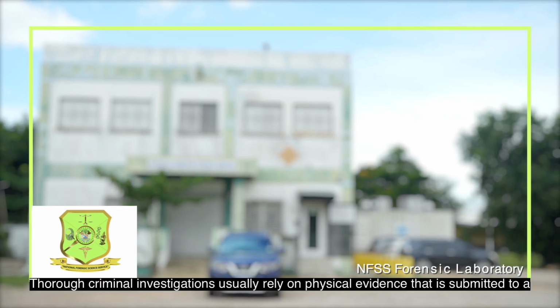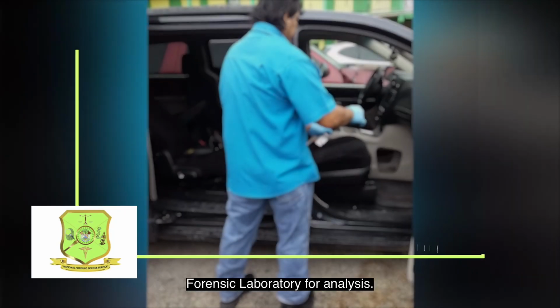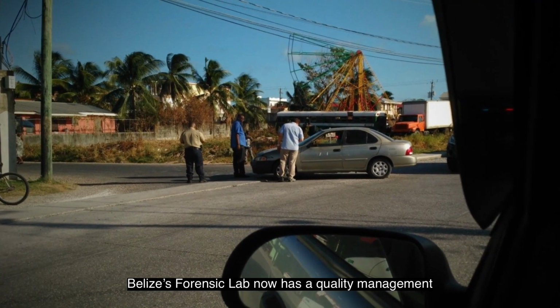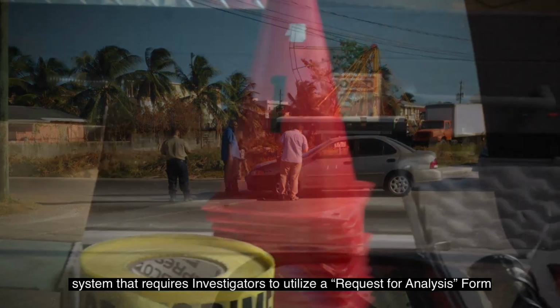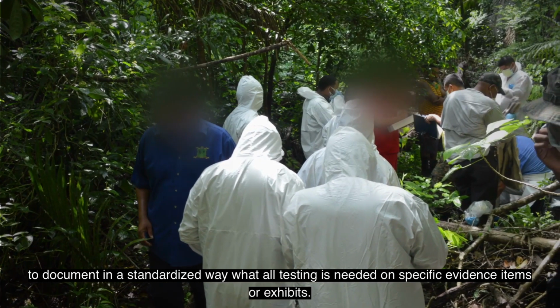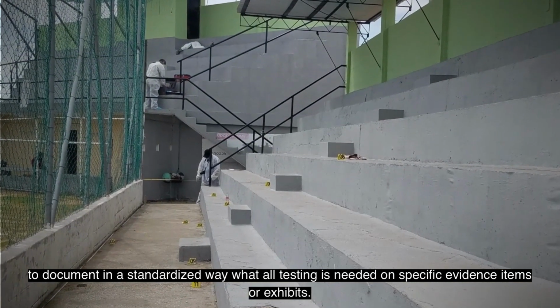Thorough criminal investigations usually rely on physical evidence that is submitted to a forensic laboratory for analysis. Belize's forensic lab now has a quality management system that requires investigators to utilize a request for analysis form to document in a standardized way what all testing is needed on specific evidence items or exhibits.